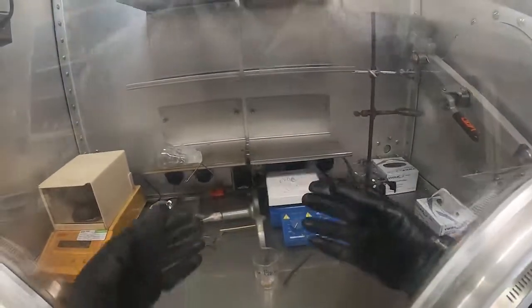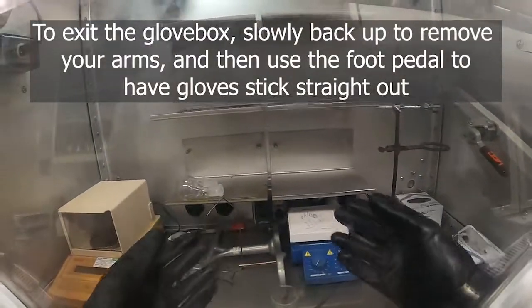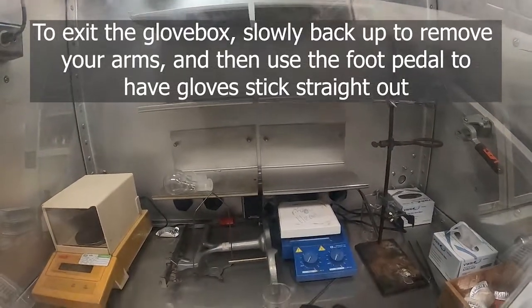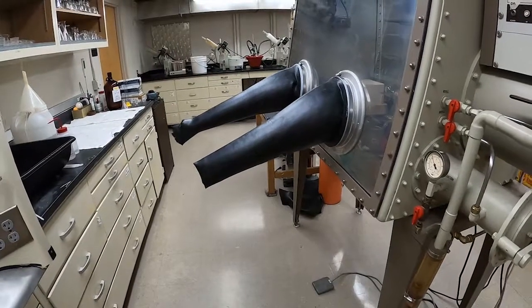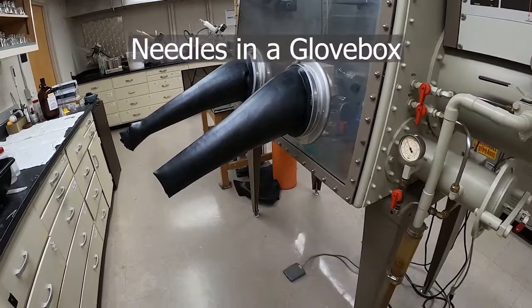Getting out of the glovebox is much easier — you just pull your arms back. Especially with good positive pressure, it's really easy to get out; it's quite a bit harder to get in.